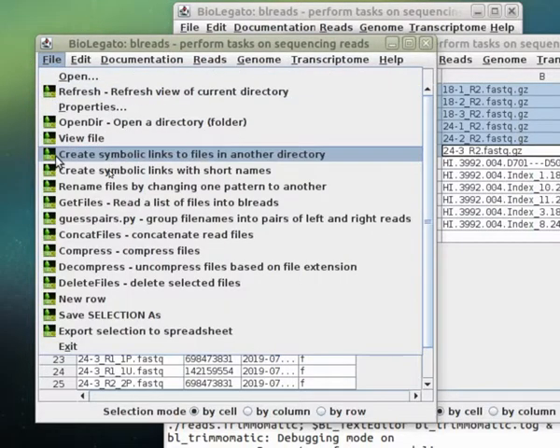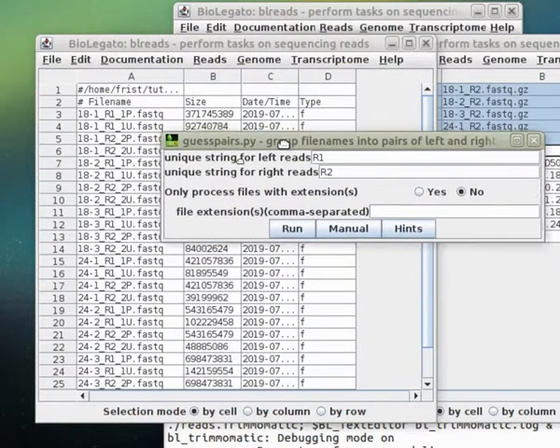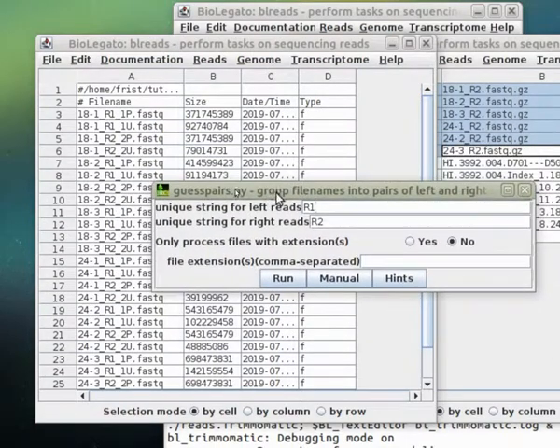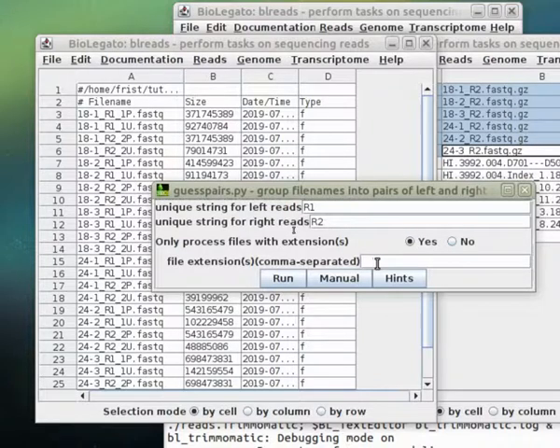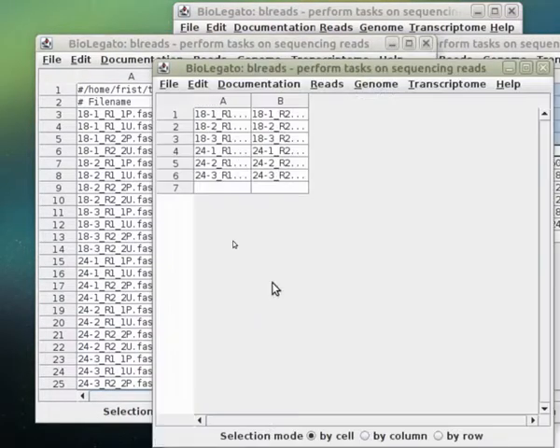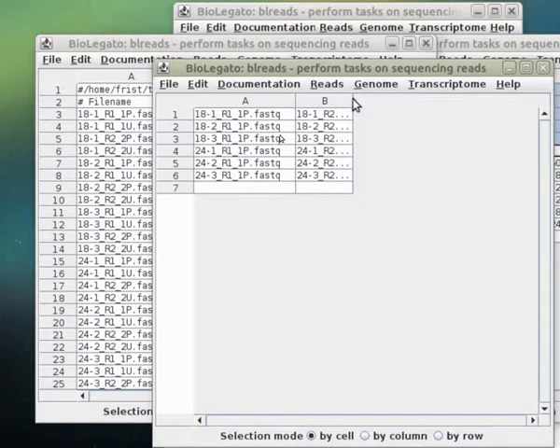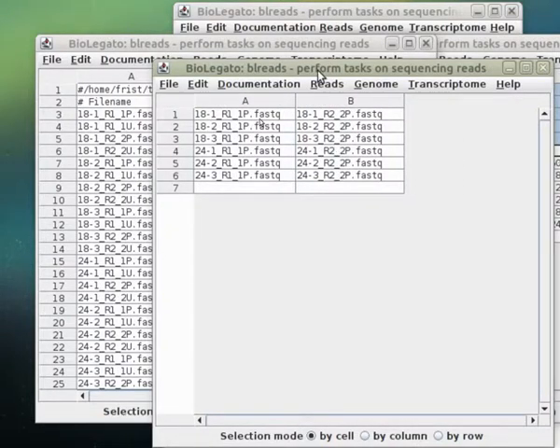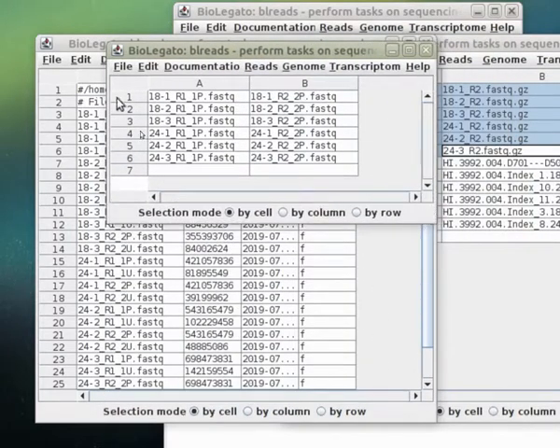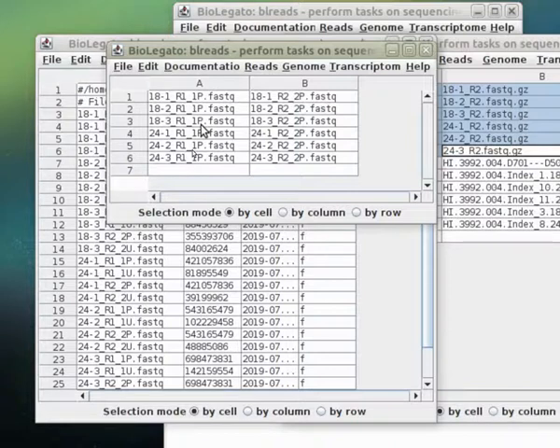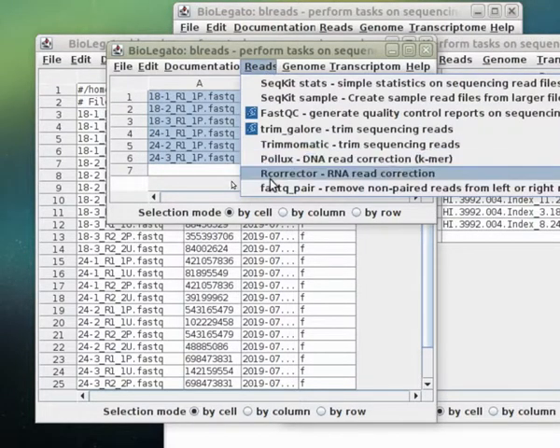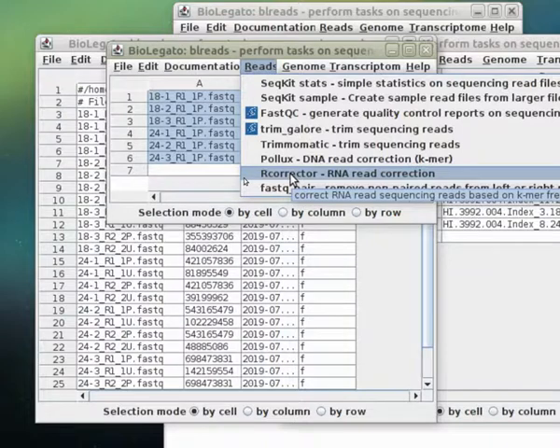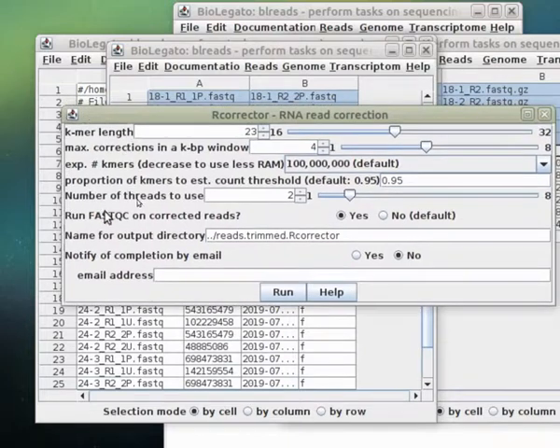I want to once again run Guess Pairs to select the files that have only the paired reads. R1 and R2 distinguish the forward and reverse reads, and we'll use p.fastq as the file extension to separate out these files. Now we only have the paired read files, and we're ready to run our next step, which is read correction. If I wanted to at this point, I could also be running FastQC to see whether the quality had changed in the reads. But for right now, we'll go on to the next step, which is correcting the reads. For that purpose, we have the R corrector program that specifically is designed to correct RNA reads.